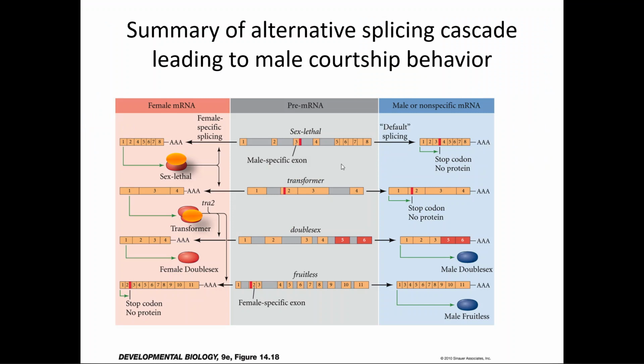And just to remind you from that introduction video, this is the image I'm talking about. So remember, this is the transformer. Okay, exon 1, exon 2. There is the female mRNA, and there's the male mRNA. So your job for question number 20 is to tell me which isoform do males form, transformer RB or transformer RA, and which one do females form?